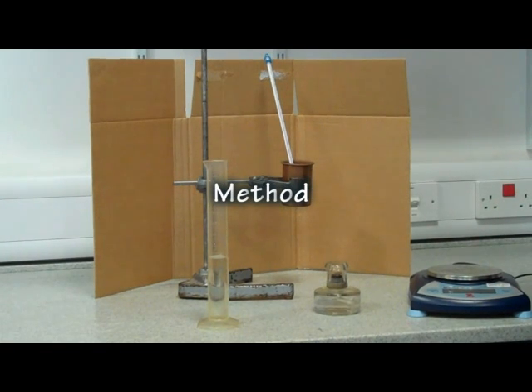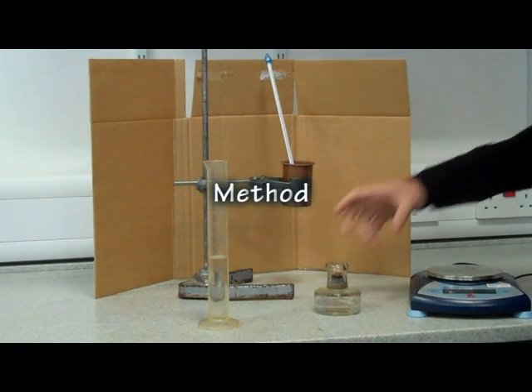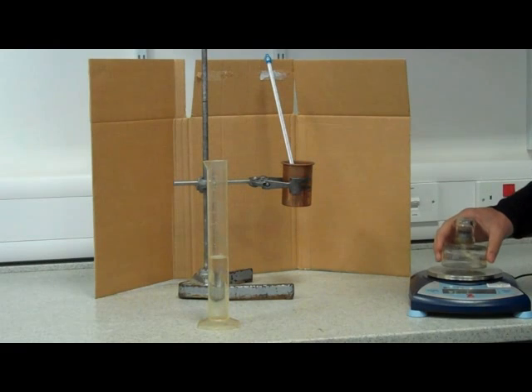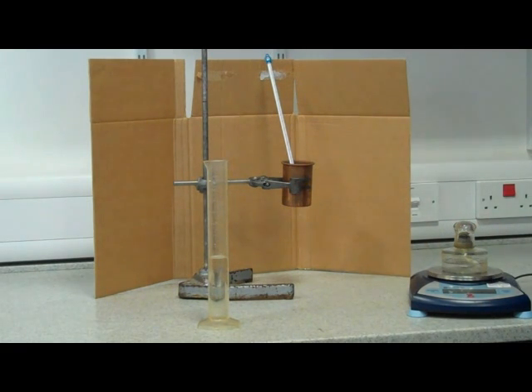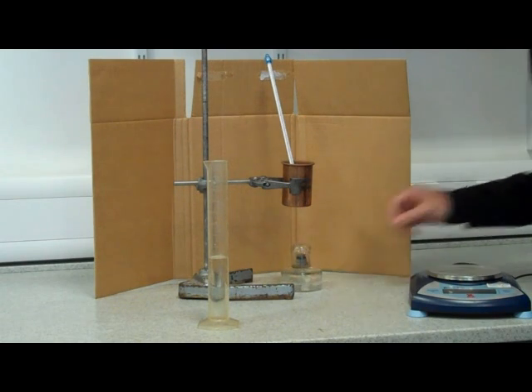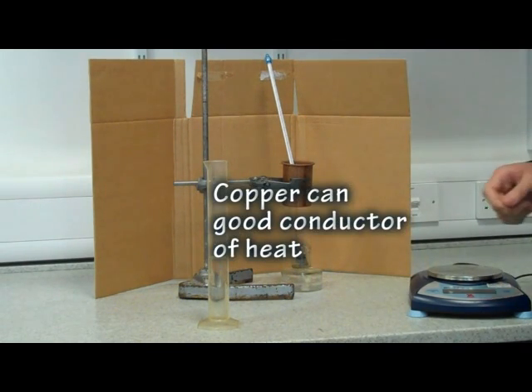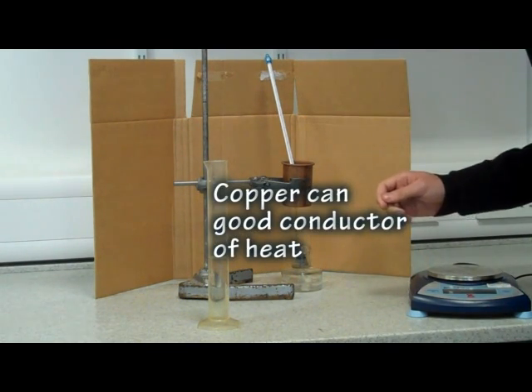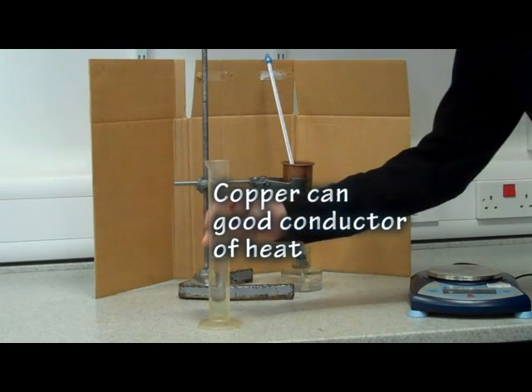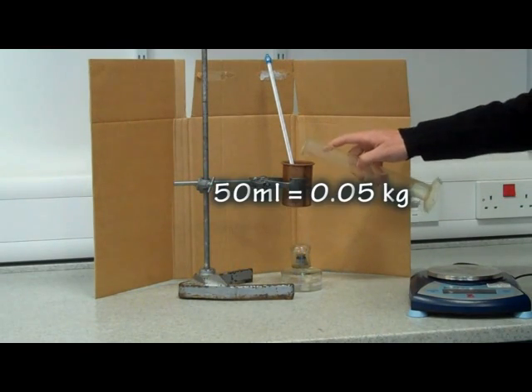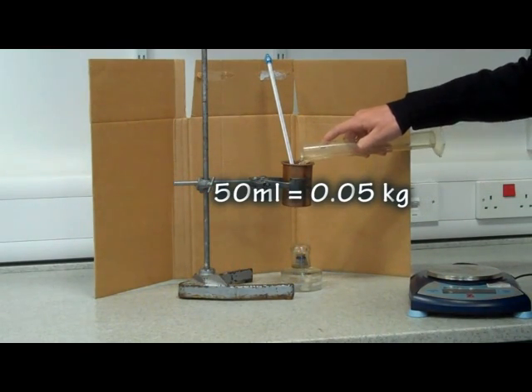We begin by weighing the ethanol with the lid on, then place it under the copper can. A copper can is used as it conducts heat. 50 centimeters cubed of water, which is equal to a mass of 0.05 kilograms, is added to the can.